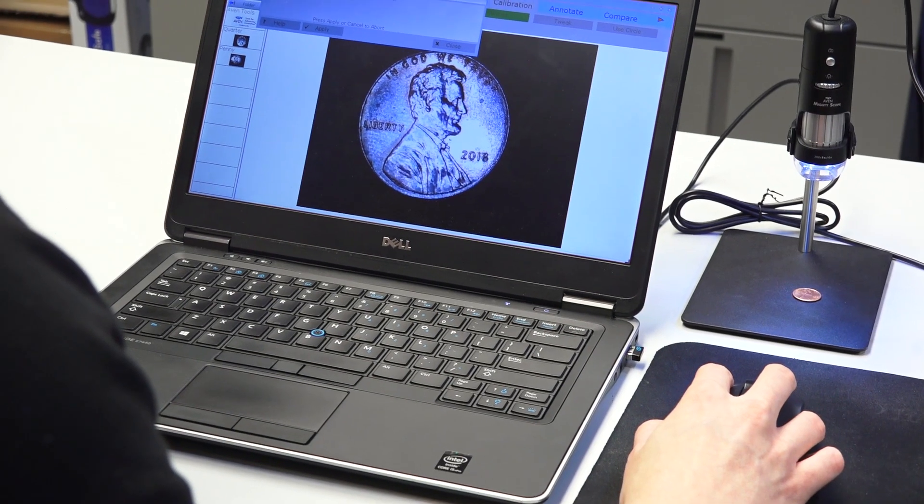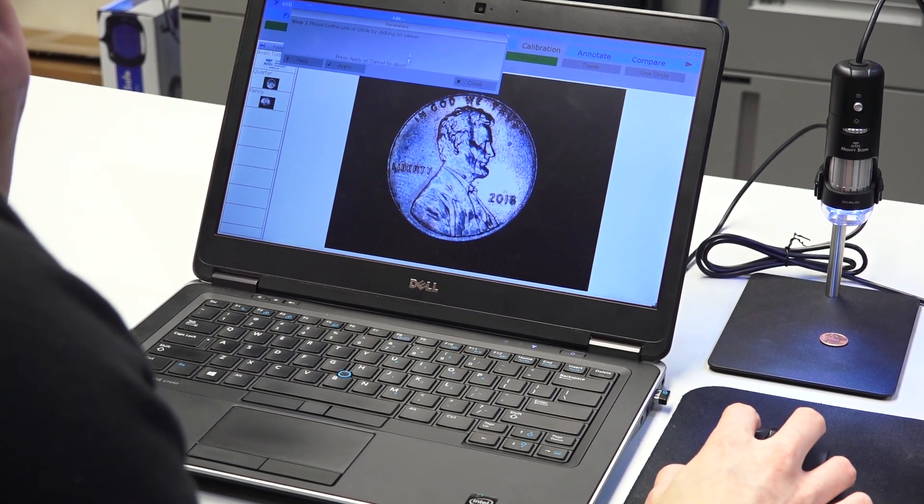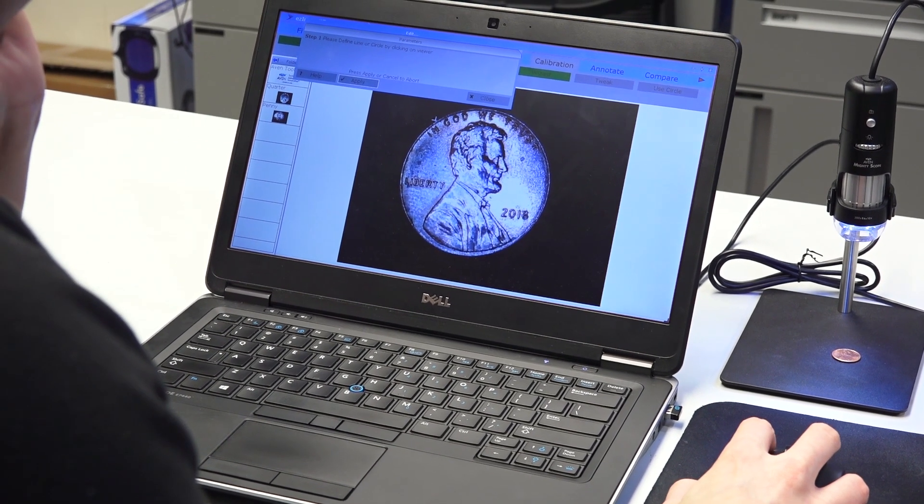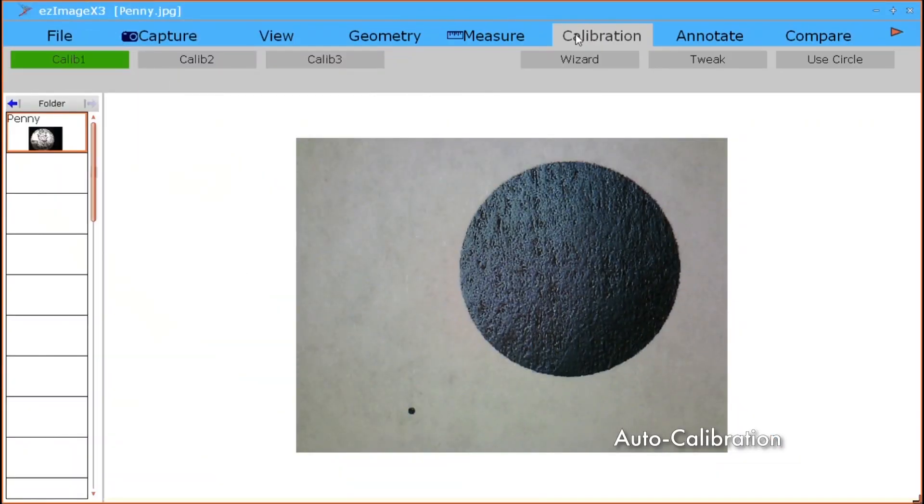Easy Image X3 has also added new features to meet the demands of today's users, such as auto calibration.